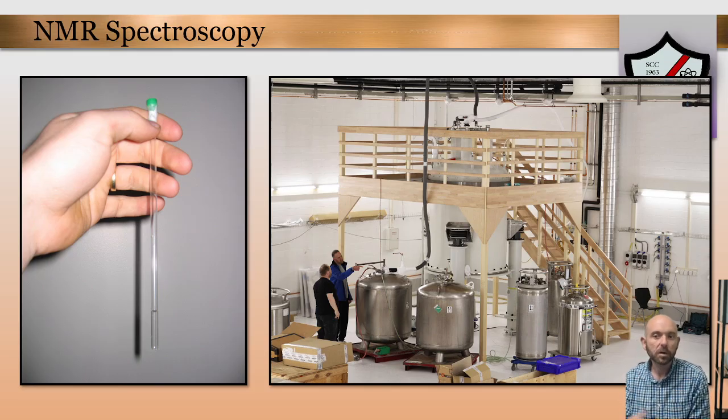The reason for the size of the instrument is because, as we'll explain in a minute, you need superconducting magnets for the theory behind the technique to work. And so these are large cooling chambers. The actual instrumentation is just some electronics inside. The big outside structure you see there is a large cooling chamber that contains liquid nitrogen and liquid helium, and that's what would be found in these shiny tanks down here that are feeding this giant cooling jacket.